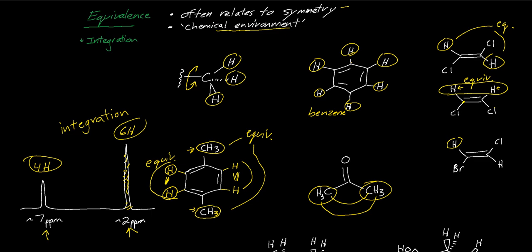However, these 2 hydrogens are not equivalent. That's also pretty easy to see because this hydrogen is attached to this carbon that has a bromine on it, while this hydrogen is directly attached to a carbon that has a chlorine on it.